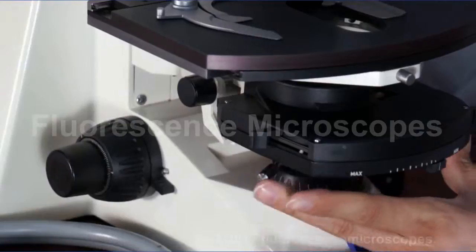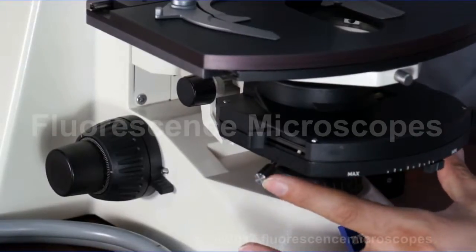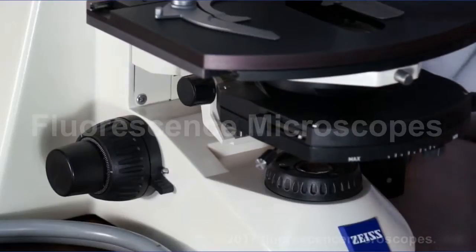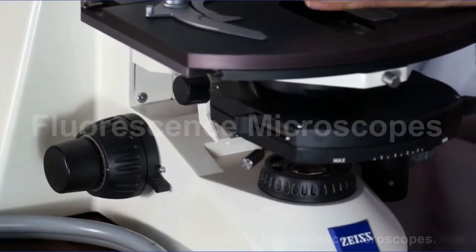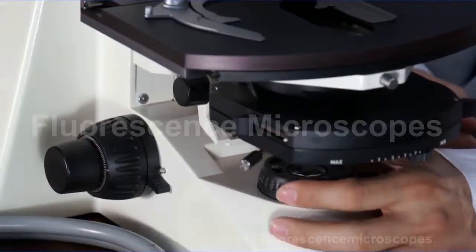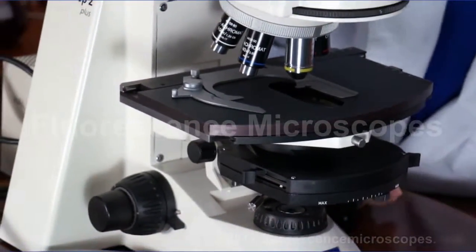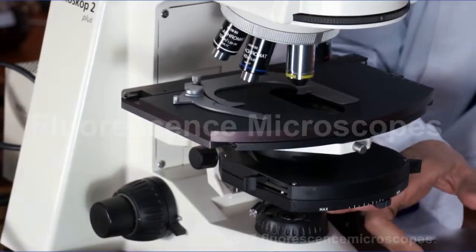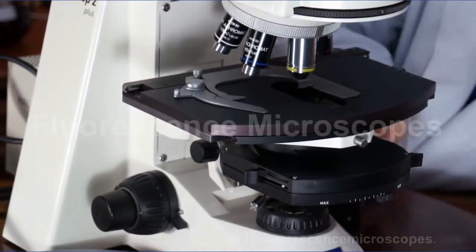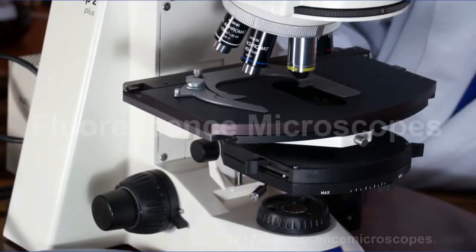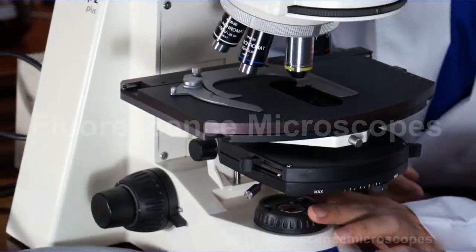It's got two centering knobs for the condenser. What you're going to want to do is turn it to about a 10 power objective. You're going to want to close down your luminous field diaphragm so that you can get this luminous field diaphragm in view, but focused. Raise or lower this condenser so that the luminous field diaphragm is in focus.